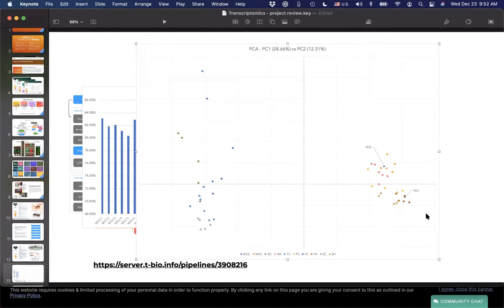That's not what I had seen on the previous principal component analysis. Well, okay, this is just something that I wanted to highlight as an important step in your exploratory analysis. These things happen, and they happen a lot. People do mislabel and contaminate samples. Maybe something happens at the stage of pooling together samples for sequencing. All kinds of issues can happen, and it's good to always be mindful that sometimes these issues can creep in. And obviously, when you do your downstream analysis, this is going to interfere with your interpretation.